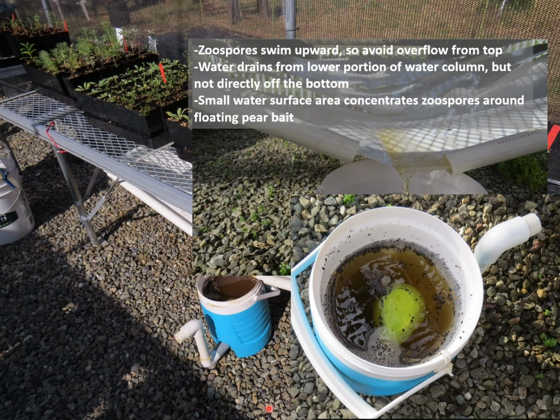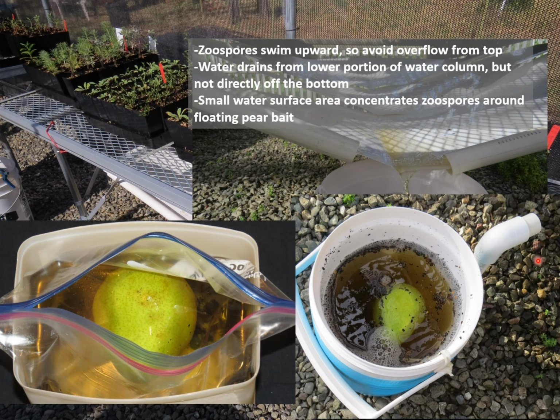We also don't pull it exactly off the bottom because there are some things in the bottom that could generate zoospores under the right conditions in the after period of incubation, which is shown in this slide when we empty out the vessel and transfer the pear and the remaining water into a bag. The other feature we have here is that the surface area is relatively small, and zoospores don't swim that far in solution, so we really want to keep the zoospores concentrated a short distance away from the pear bait.